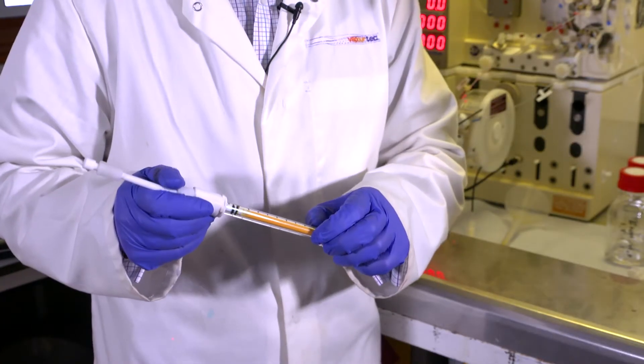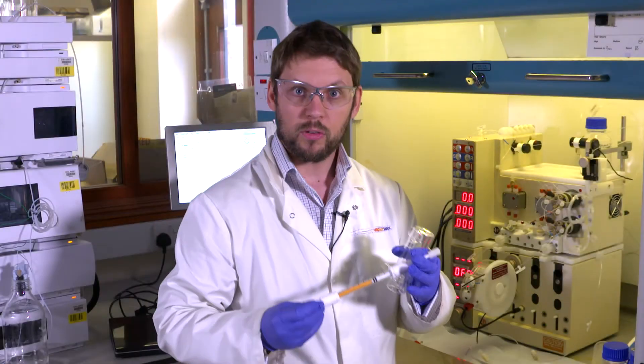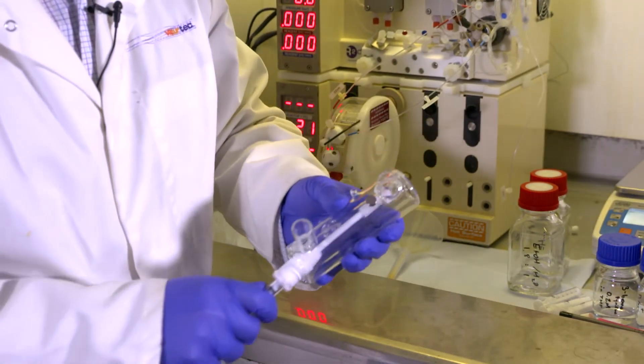Now my column is packed I need to weigh it before and after I fill it with solvent so I can work out what the volume inside is. Now I've weighed my column I need to put it inside the heat exchanger and onto the system so that I can flow the solvent through it.